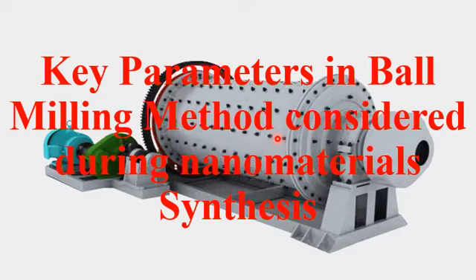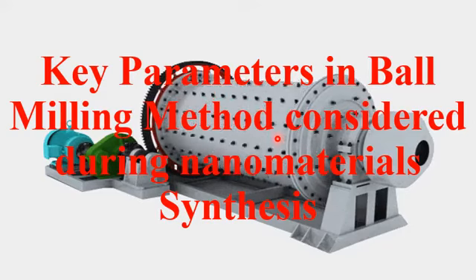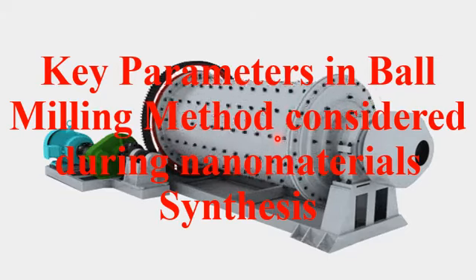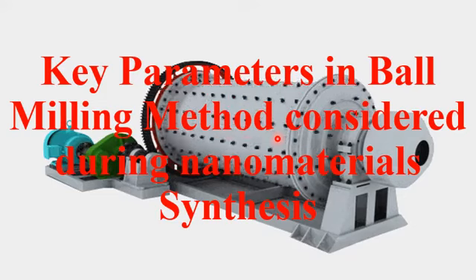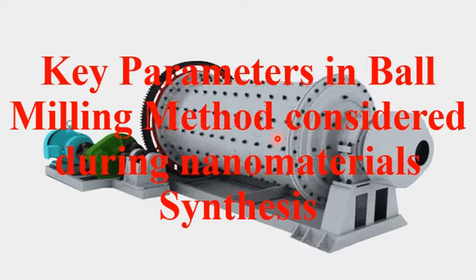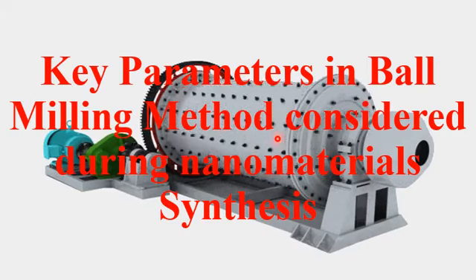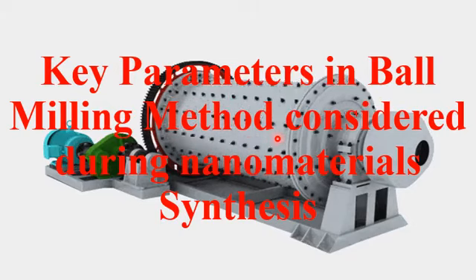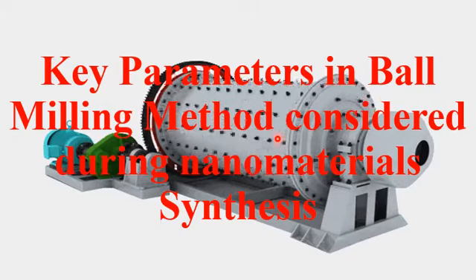There are also other associated physical parameters in the ball milling process. So I will briefly explain one by one all the associated physical as well as chemical parameters which we need to think about before using the ball mill apparatus, in order to get highly desirable nanoparticles.